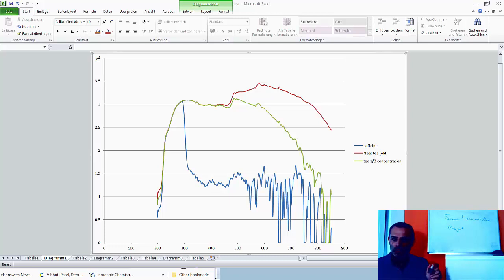And if we look at tea we can see that tea absorbs a lot of light. So absorbance is up. A higher amount of absorbance means less light comes through. It's a log scale, and there's a log scale because then the concentration is linear with absorbance. So we can see here that if I take neat tea it absorbs a lot of light all across the spectrum and it's difficult to see what happens down at the caffeine region.